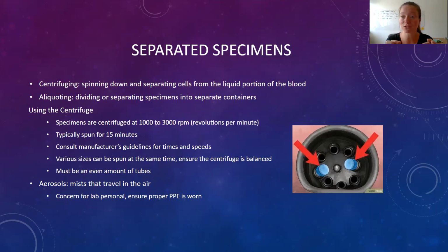If it's not balanced, it can actually be hazardous to us as the phlebotomist standing next to it. It can break, it can shatter, it'll shake kind of roughly. So we have to balance our centrifuge.